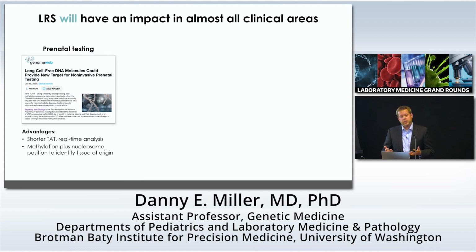It also gives you the ability to do real-time analysis. You can imagine that as the data is coming in, you can see, is there a deletion? Is there an extra chromosome? Things like that. You also get methylation along with the nucleosome position, right? The fragment position tells us about the nucleosome, but we also get the methylation as well, which can give us more confidence when we're separating maternal and fetal reads.